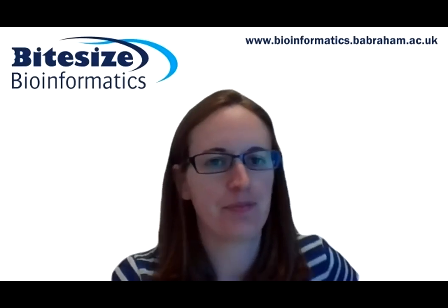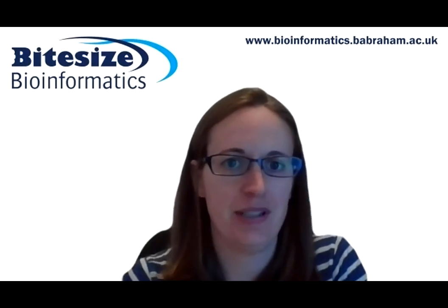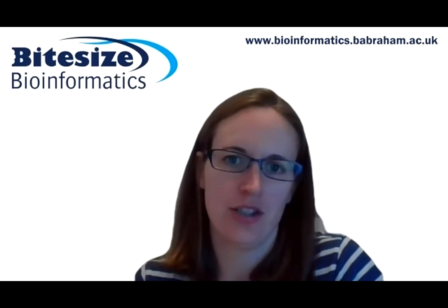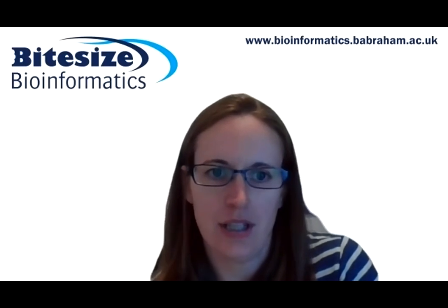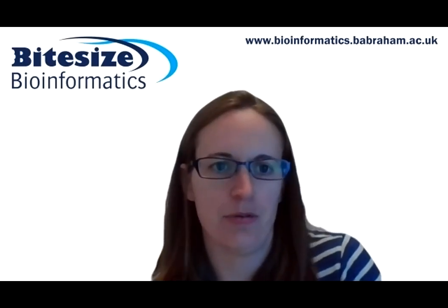about GOLiath. This is a piece of software for performing gene set enrichment analysis. And I'm also going to have a look at a couple of other tools for carrying out this type of analysis as well.